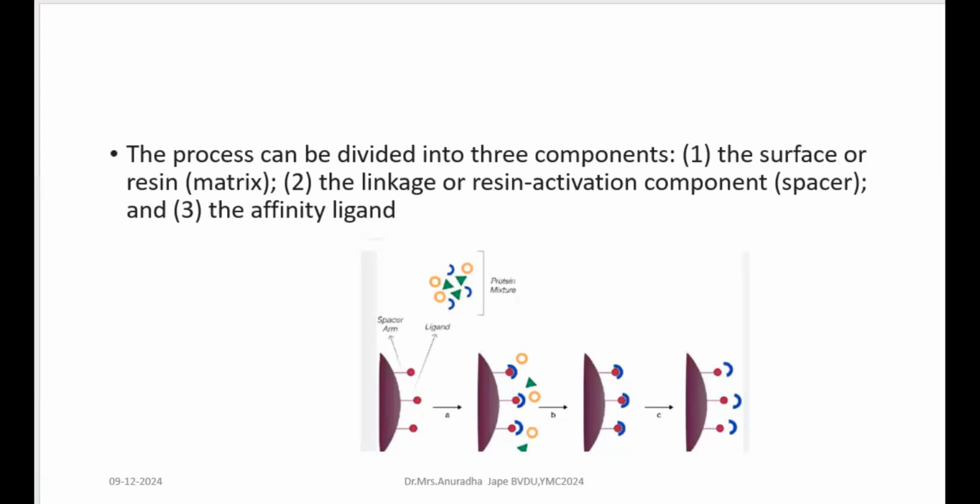Of course, there are a variety of spacer arms available. For example, you can use diamino dipropylamine. With diamino dipropylamine, you get to know the nature of the molecule, right? That amine group is going to be the functional group, and the rest, diamino, is another one. So diamino will react with the support matrix, and the amine may be available for your target. And in between you have dipropyl. When I say dipropyl, it is a hydrocarbon, right?